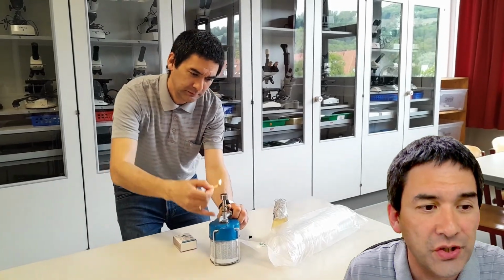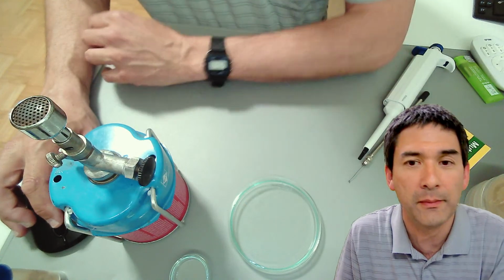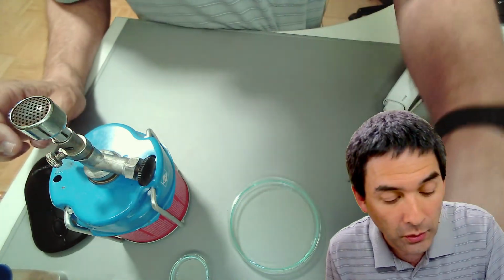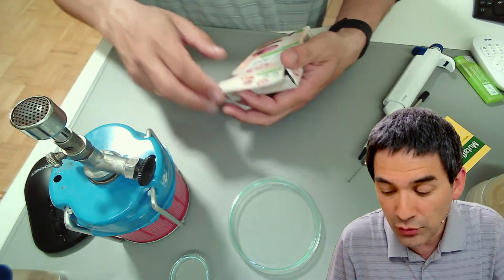Okay, so now the video starts again, and here I'm back again. Do you want to know what the agar and the yeast extract look like?